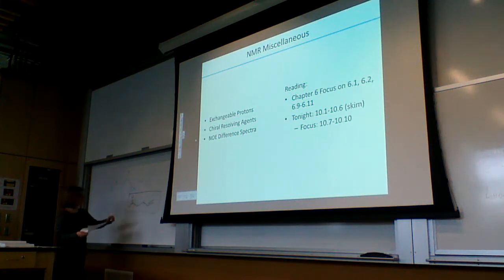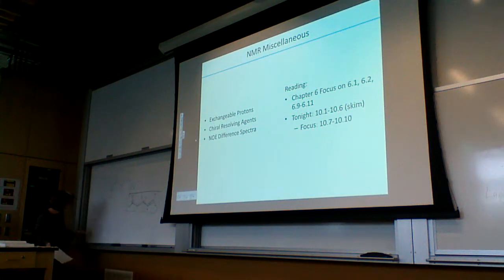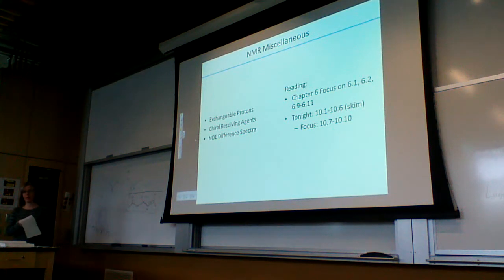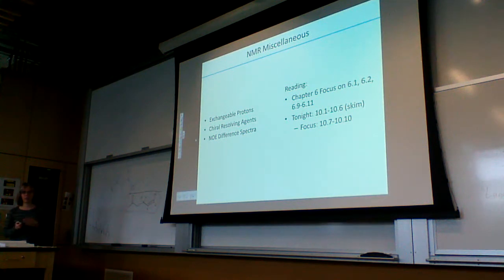So actually, we were looking at this hydrogen, but same story. It has the two hydrogens that are equivalent here. We also have two different hydrogens, so in this case, it's going to split again at a different value. And I'm just making up values here. We'd have to analyze it to see what it is. But you're going to end up with some random splitting there. But the key here is that these two hydrogens split it the same amount. And you'll measure all those values from the NMR.